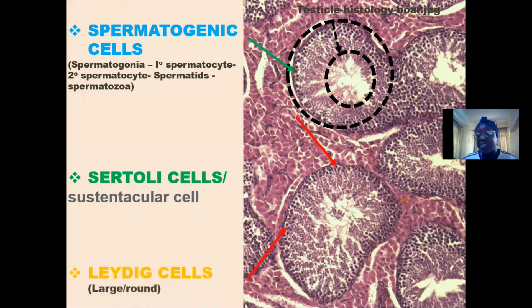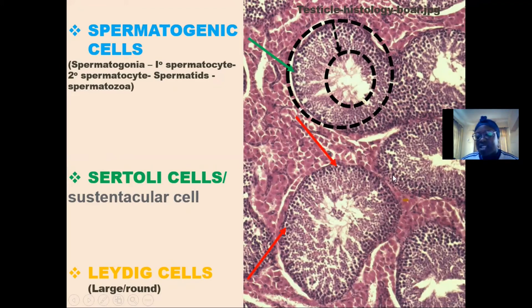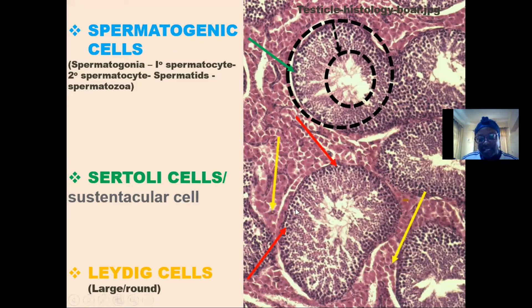The third type of cell is the Leydig cell, or the interstitial cell of Leydig. Each lobe of the testes is made up of seminiferous tubules and interstitial tissue. Outside the seminiferous tubules, we have the interstitial tissue. Within this interstitial tissue is where the Leydig cells are located. This is the Leydig cell, and this is another Leydig cell seen in this region.